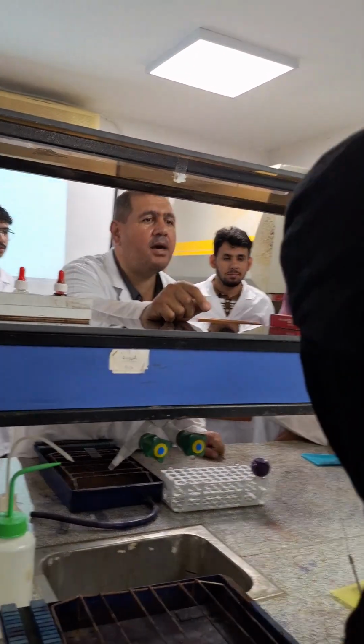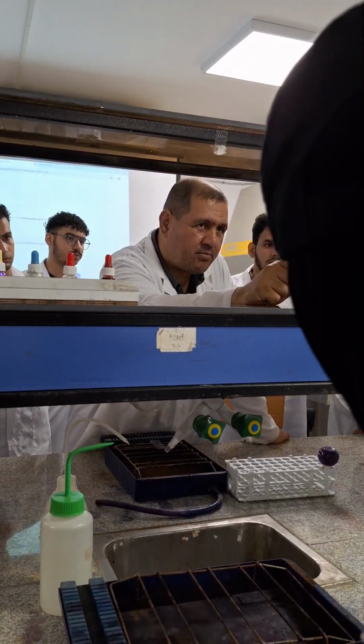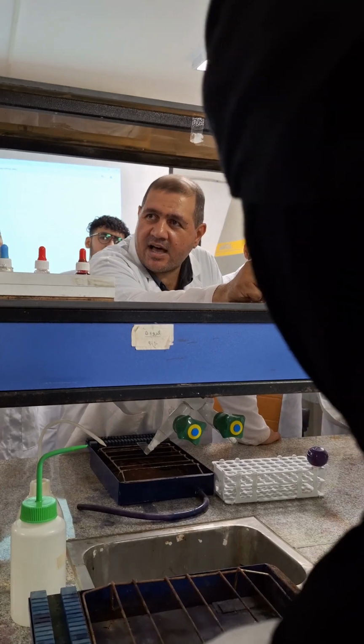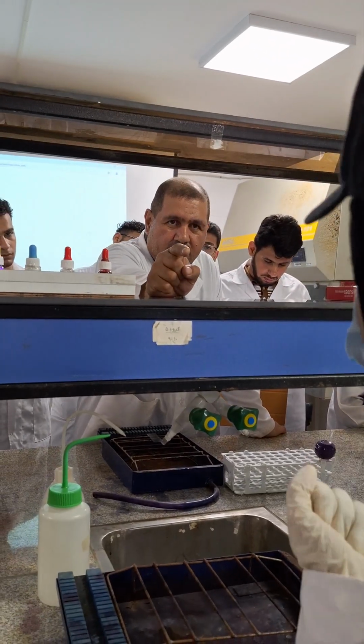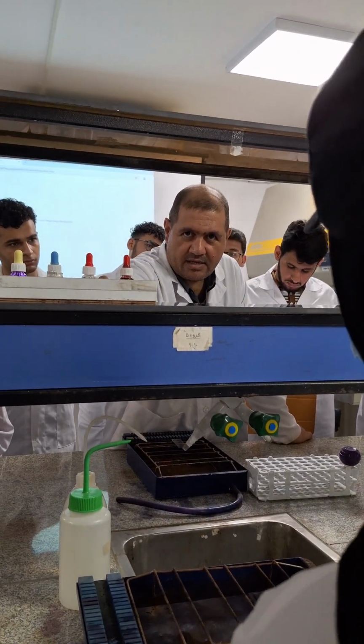Gram negative is pink, the color of safranin. Okay?